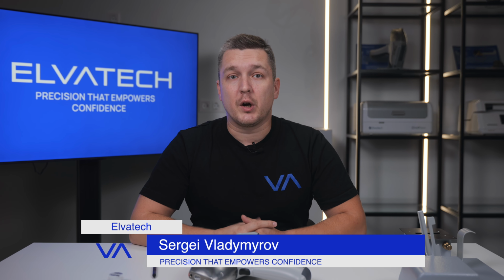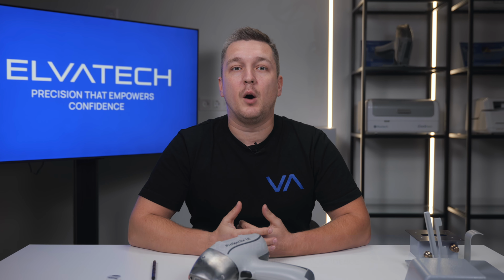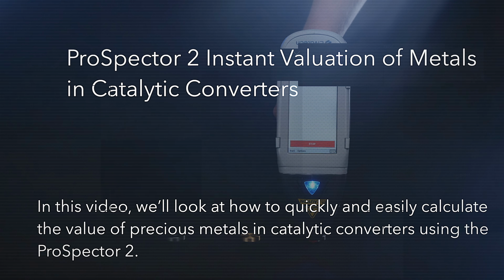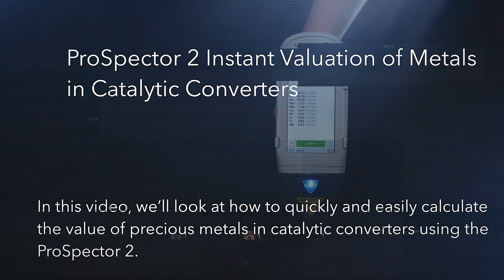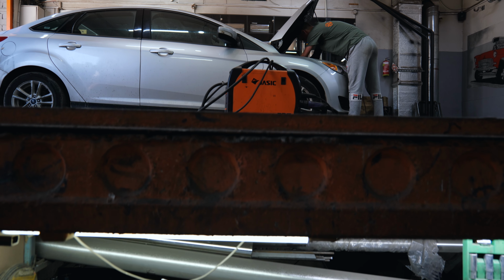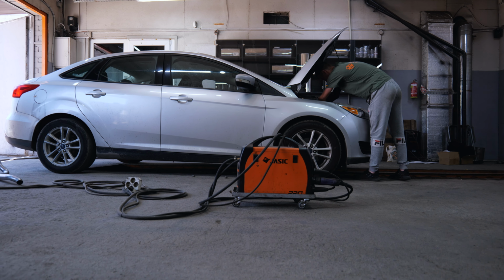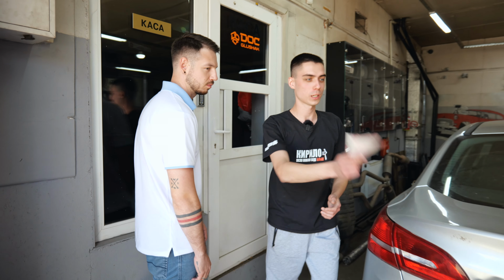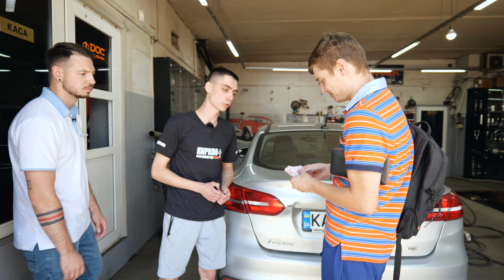My name is Sergey, and in this video we will look at how to quickly and easily calculate the value of precious metals in catalytic converters using the ProSpector 2 analyzer. People who buy or process catalytic converters often need more than just the composition. They also need an instant financial estimate. You have to know how much a converter is worth based on the actual content of platinum, palladium and rhodium.